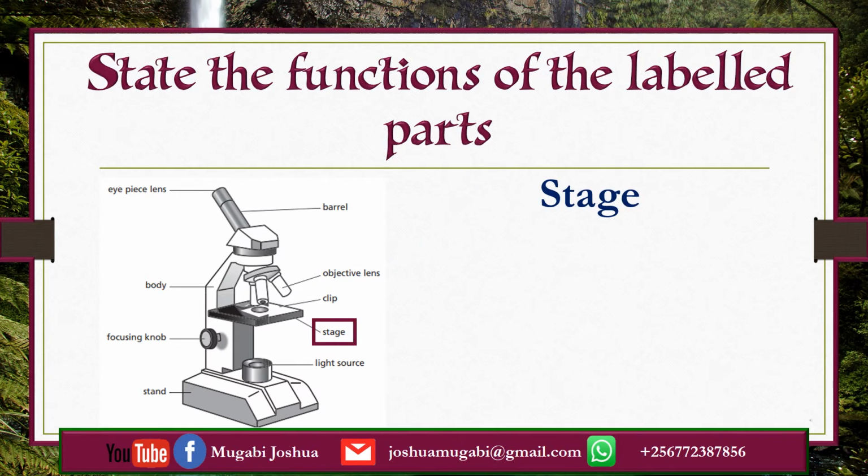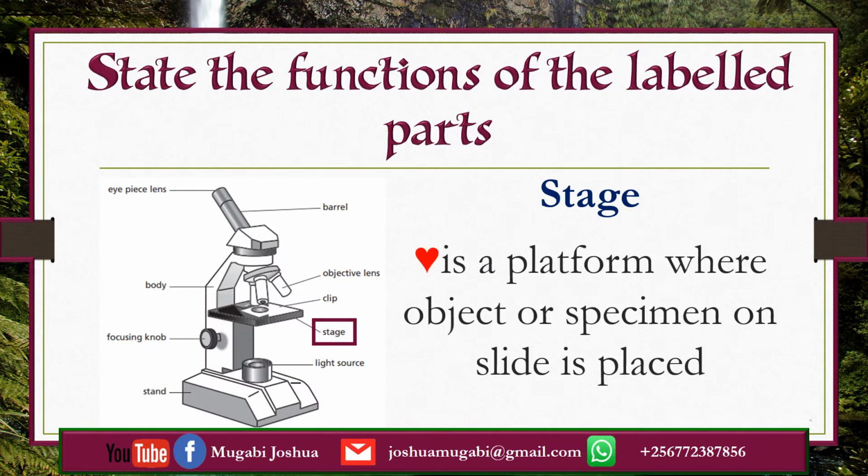The stage. The stage is a platform where the object or specimen on a slide is placed.